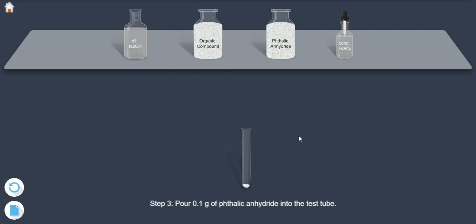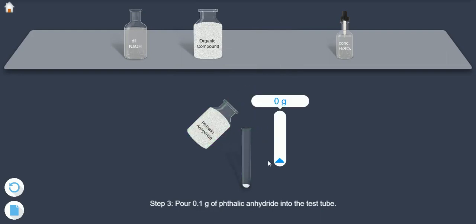Step 3: Pour 0.1 gram of phthalic anhydride into the test tube.